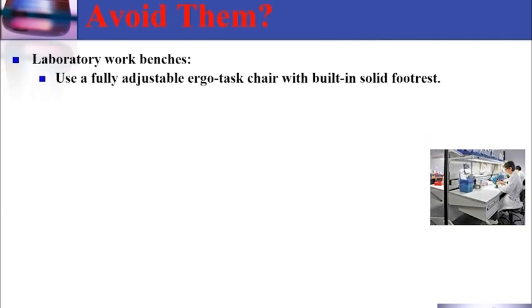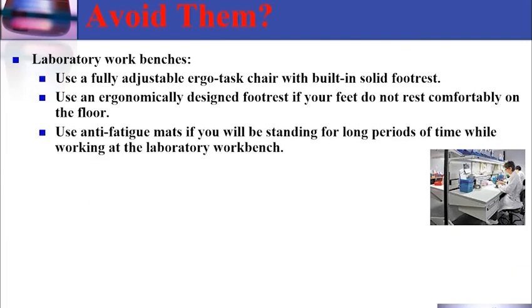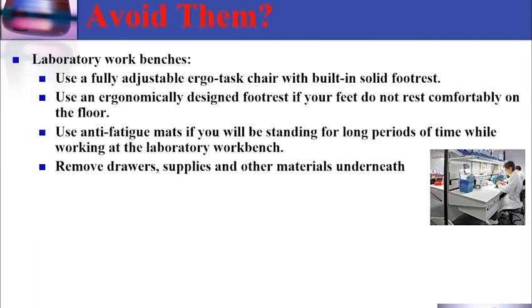Laboratory workbenches: use a fully adjustable ergo task chair with a built-in solid footrest. Use an ergonomically designed footrest if your feet do not rest comfortably on the floor. Use an anti-fatigue mat if you will be standing for a long period of time while working at the laboratory workbench. Remove drawers, supplies, and other material underneath the workbench to provide leg room.